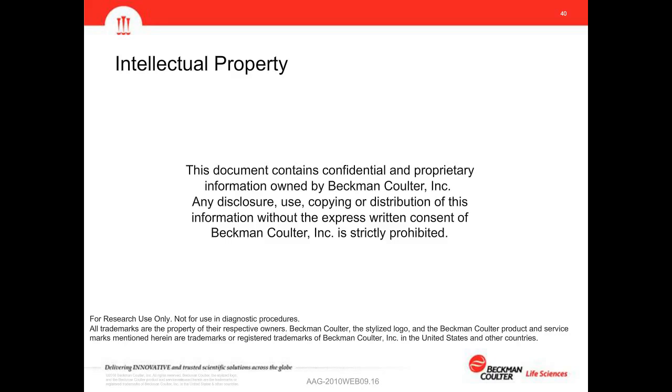You attach it once. Now, as you drive through the automated system, it will copy that information if you're moving the sample, or maybe you're using information that's attached to the sample to perform some sort of pipetting operation. It could be a threshold, and if the OD value is above your threshold target, then only those wells get copied, and so the automation behaves differently every day because the OD values are different every day, but it automatically selects the ones above your target threshold.